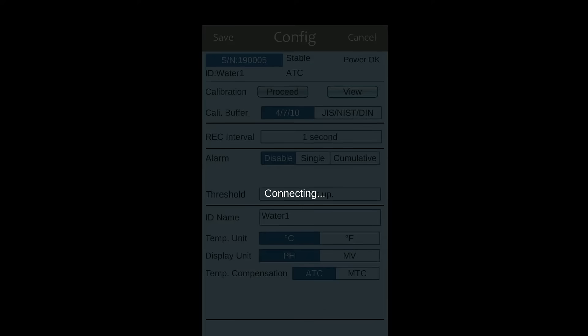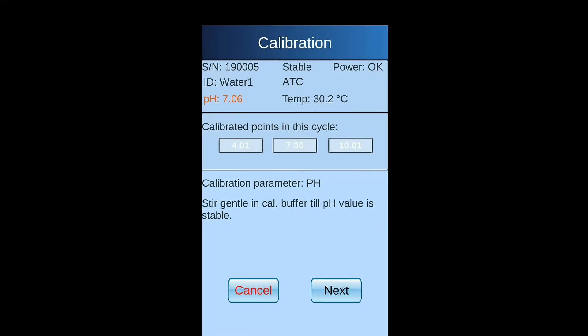Pressing proceed into calibration. While seeing reading is stable, press next key to next page.